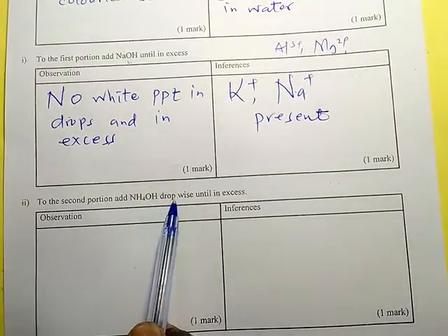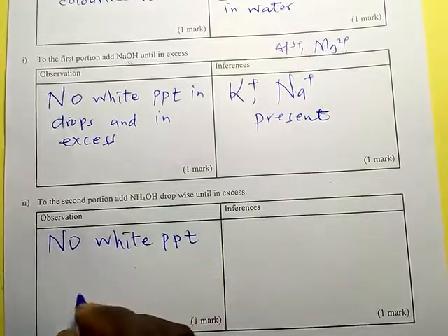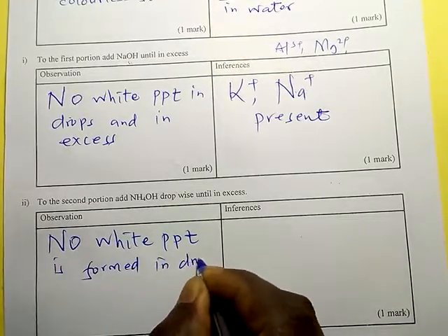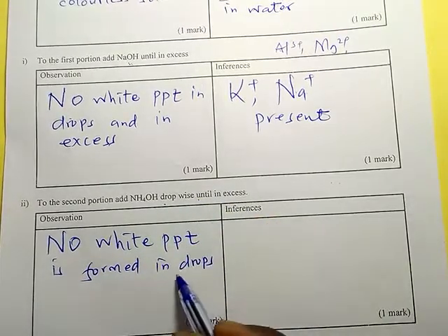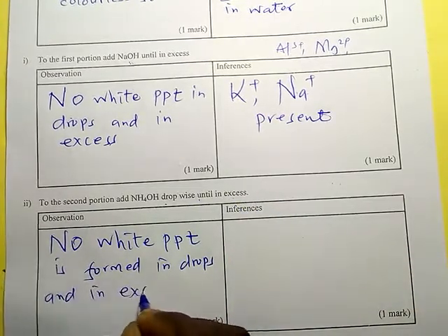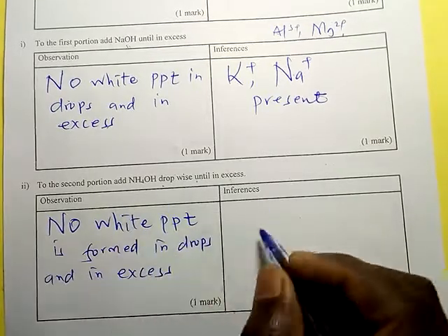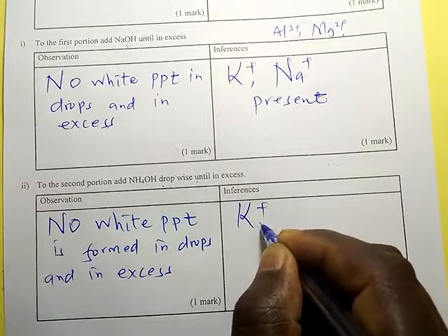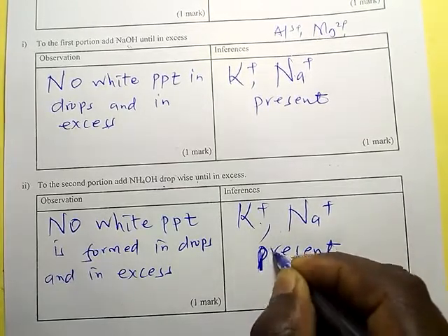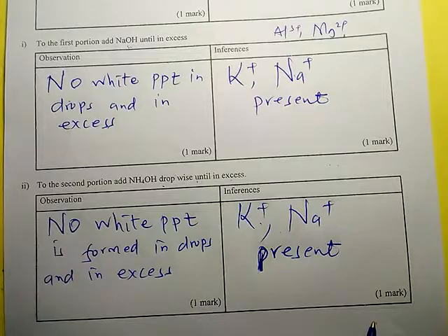For the second portion, add ammonium hydroxide dropwise until in excess. No white precipitate is formed in drops, and there was no white precipitate in excess. So that one actually tells you potassium ions, sodium ions are suspected to be present. I want you to get used to giving positive results, that is, what is present, what is suspected to be present, and avoid as much as you can what is absent.